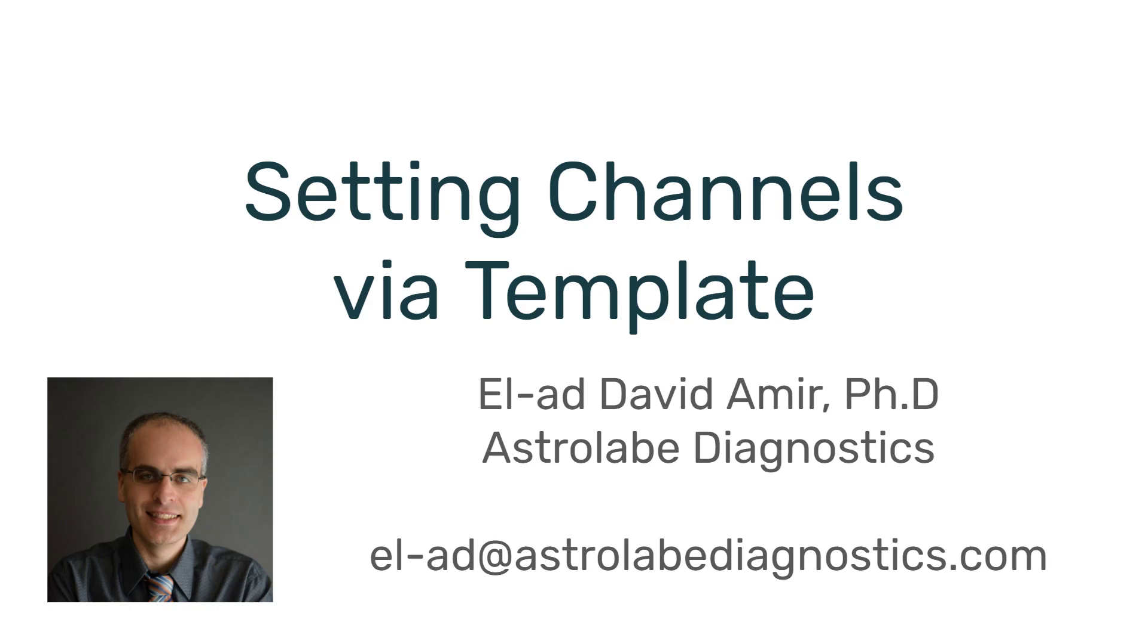Hello everyone, this is Elad from Astrolabe Diagnostics, and today I'm going to demonstrate a new feature where you can set up the channels in your experiment via a spreadsheet template.